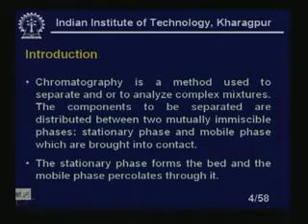The stationary phase forms the bed and the mobile phase percolates through it. So we have a bed, the packed bed column we are talking about. That stationary phase will make the bed and the mobile phase will percolate through it.